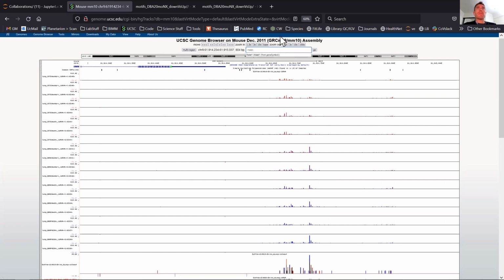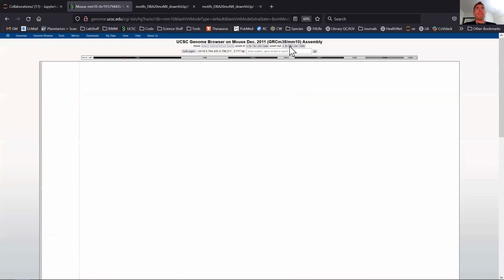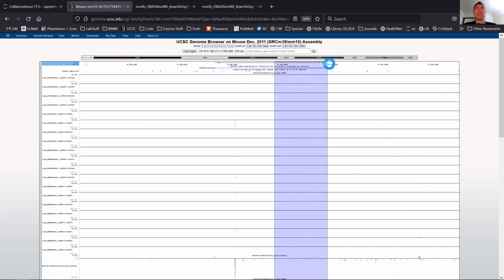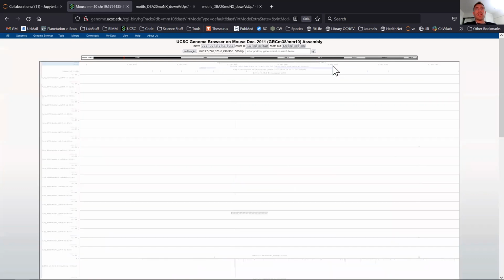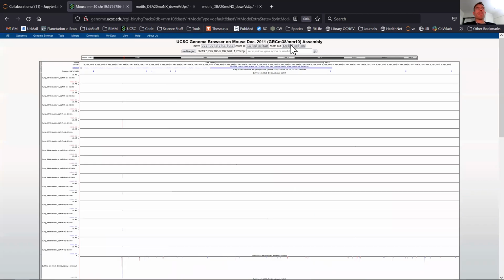Another one that's quite often worth looking at is this MALAT1 gene. This gives you just an idea, because MALAT1 has this crazy long exon. And the question is, when you go across this long exon, do we actually see any significant csRNA-seq reads? And there is some, right? If you look at the scale, it's 12, something like that. And then when you zoom out, there's some MALAT1 enhancer.